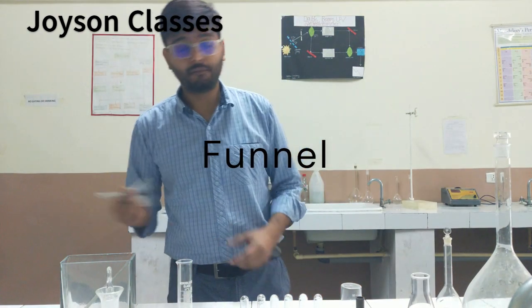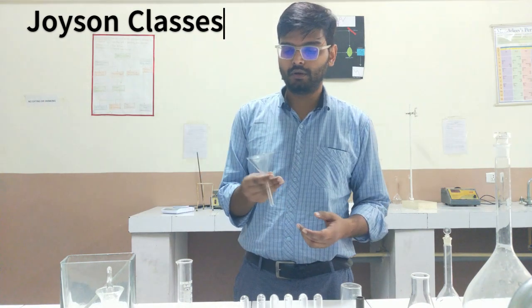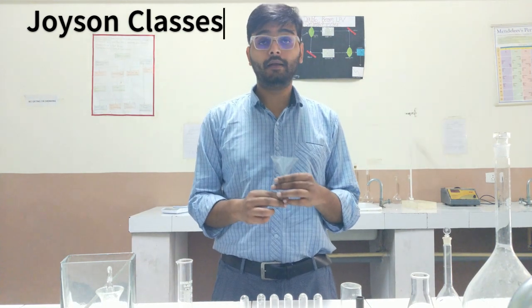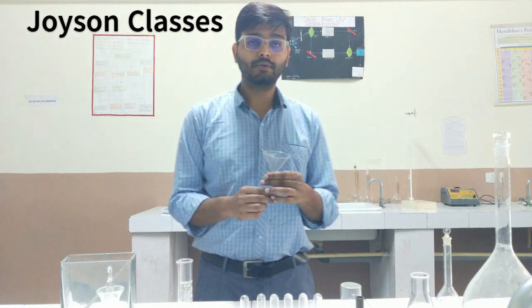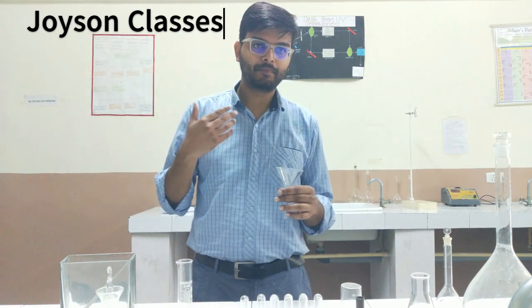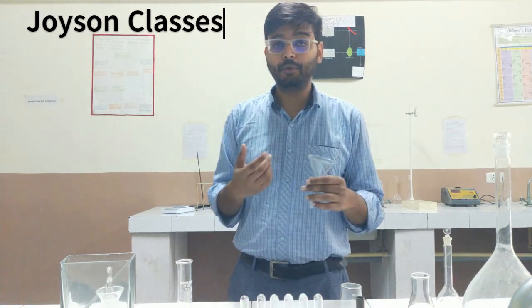Next is the funnel, and this is basically used for filtration purposes, as the filtration assembly, but it is also used for pouring large volumes into some other container.